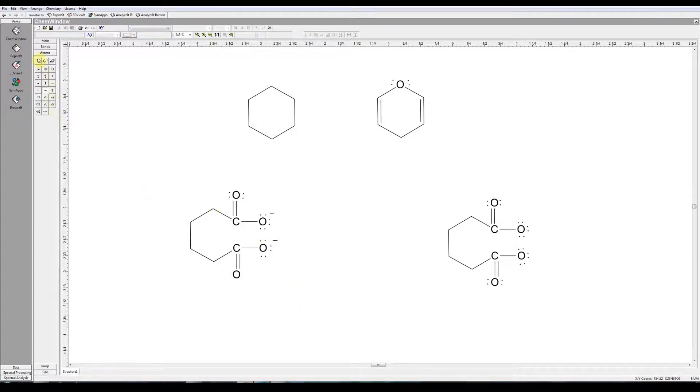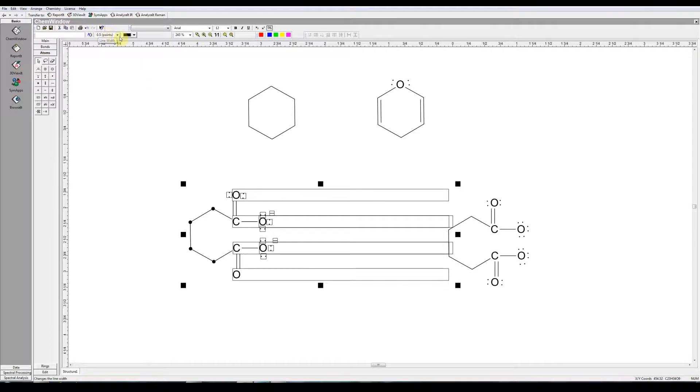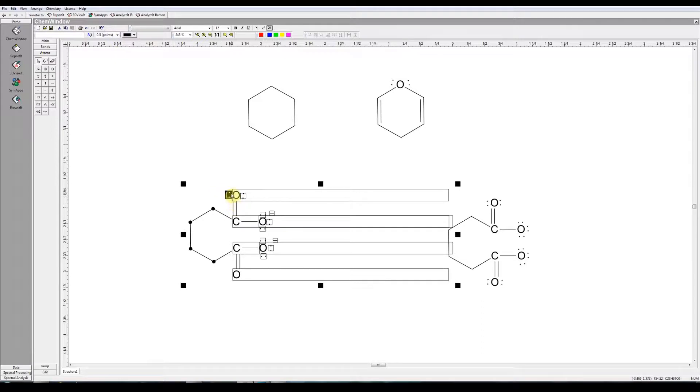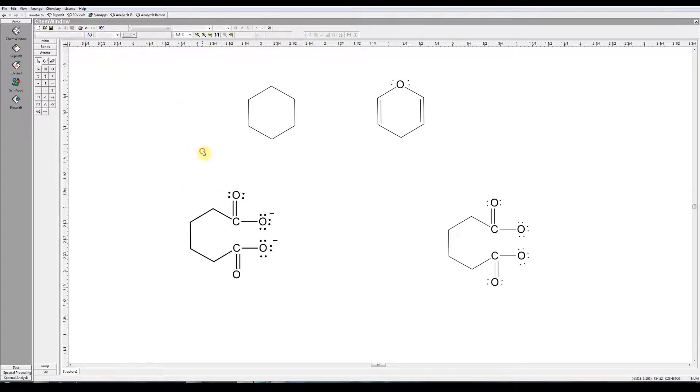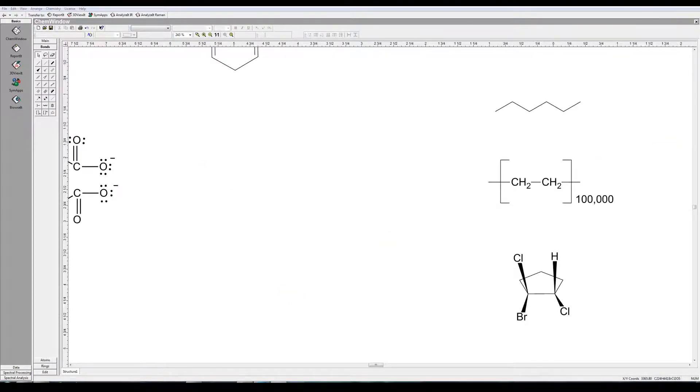Now you may think those non-bonded electrons are too small. There is a way to adjust that. Let's go to the selection tool. Select our structure. And up here you notice the default was 0.5 points for our lines. Well that gives us small bonds. It gives us small electrons. If we choose, say, one point, then everything is darkened up. And that perhaps looks a little better.